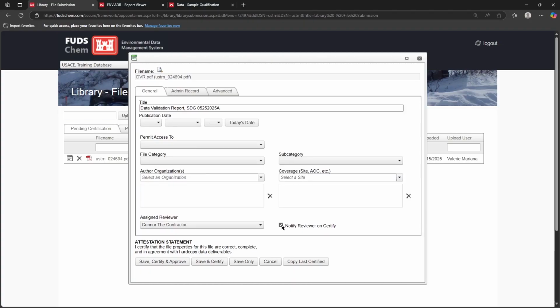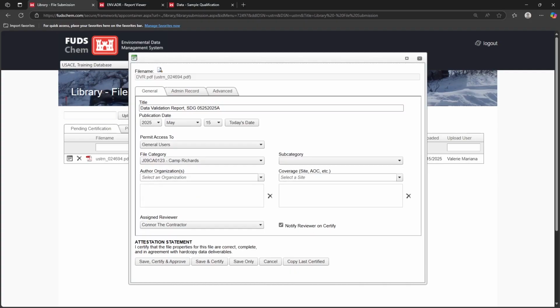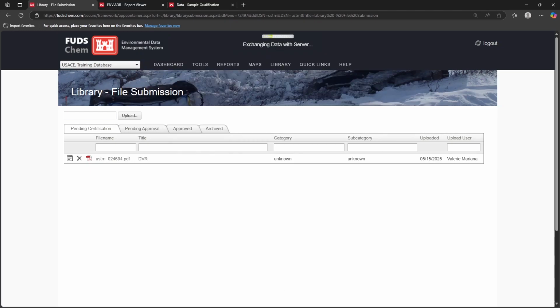He'll want to do a review himself before passing along to the core chemist for review and approval. I'll click Save and Certify.